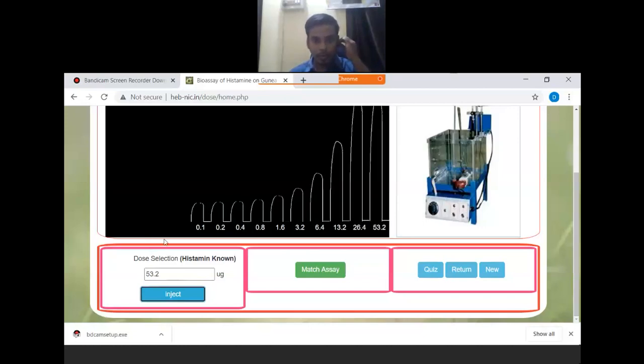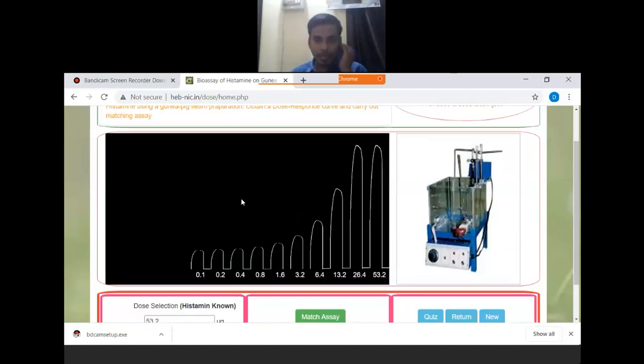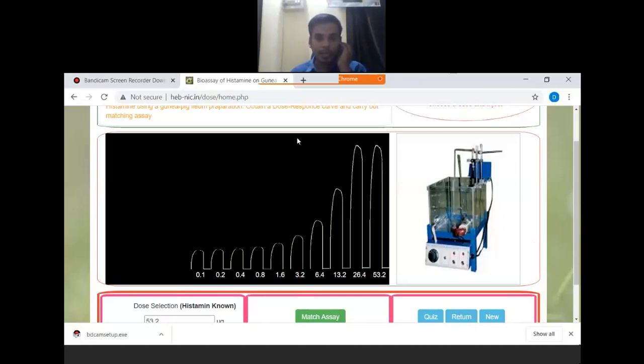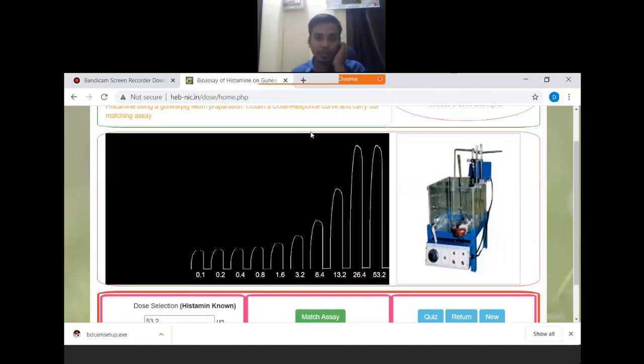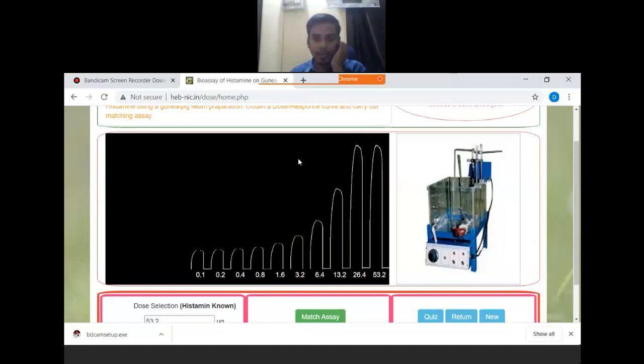You can see here after moving the doses to 26.4 and 53.2, the response height is coming as the same. So actually at the concentration of 26.4, the maximum effect is achieved - it is 100 percent of response. At this level, the drug has actually 100 percent of effect, and this effect is known as ceiling effect.